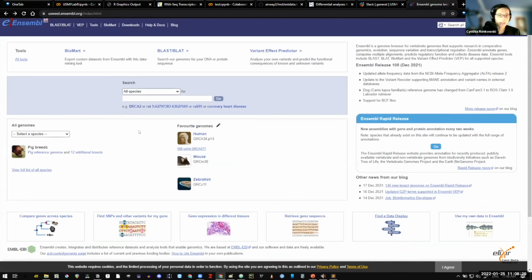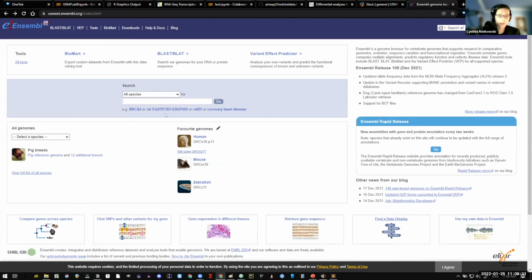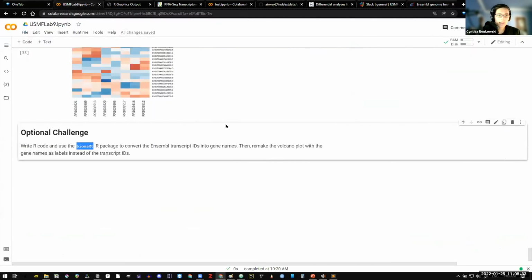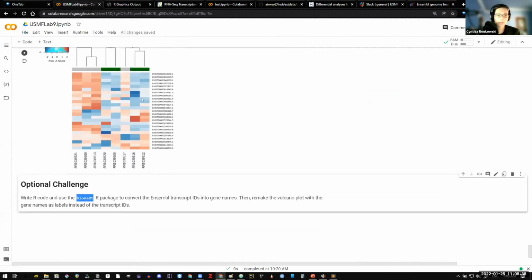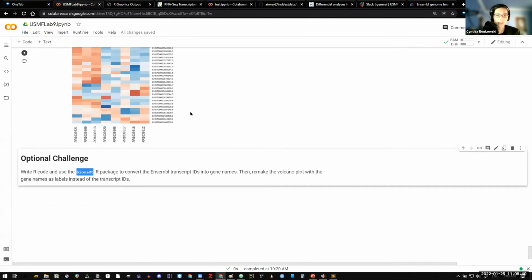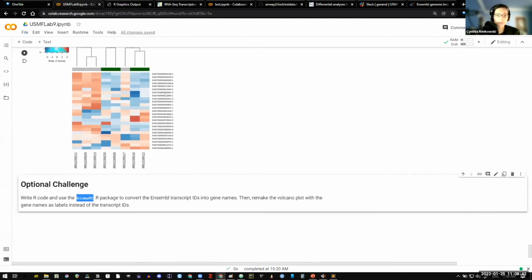But okay, yeah, I'll look it up on this website, and for all of the thousands and thousands of transcripts, it'll then provide the name of the gene that the transcript is associated with.